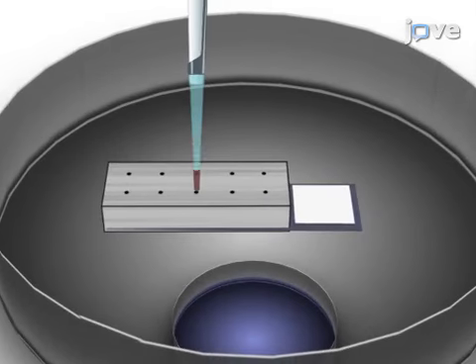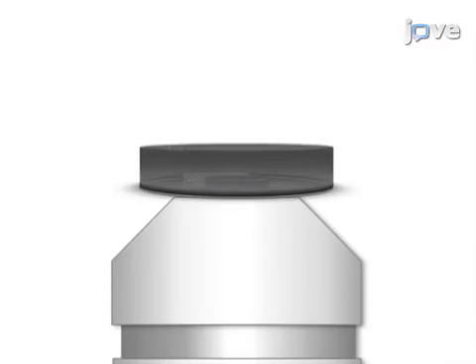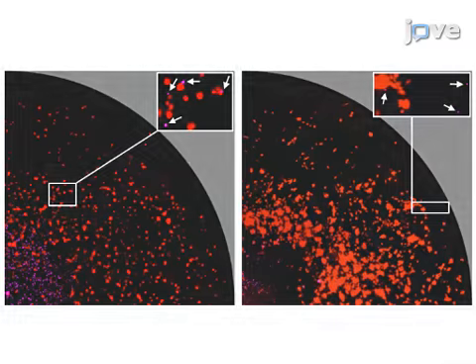a cell sedimentation manifold. Next, light and fluorescence microscopy are used to visualize the migration of the non-adherent cells over the monolayer. The results show that the migration and effector functions of non-adherent T lymphocytes in co-culture with an adherent tumor cell monolayer are maintained after the lymphocytes have been transduced with a retroviral vector.